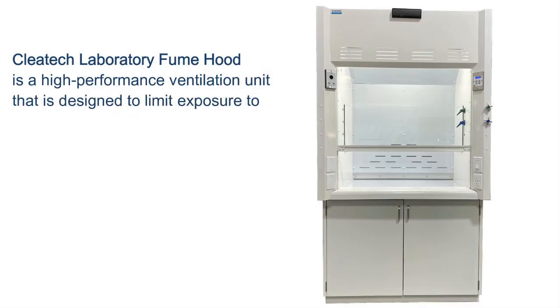Cleatech laboratory fume hood is a high-performance ventilation unit designed to limit exposure to hazardous or toxic fumes, vapors, or dusts.